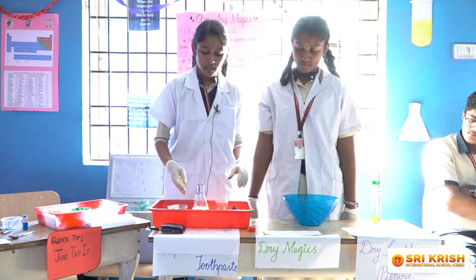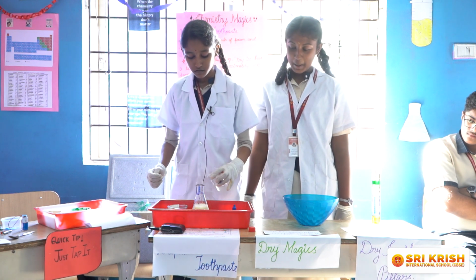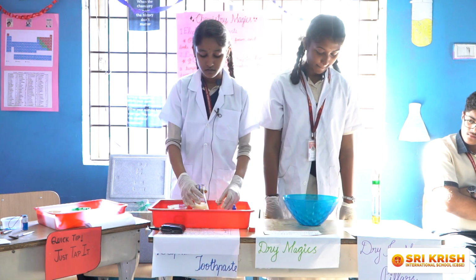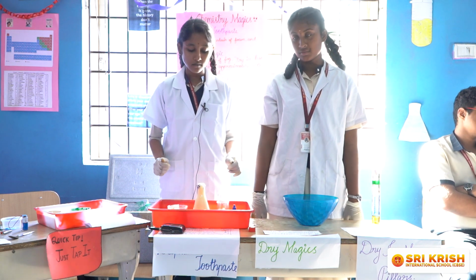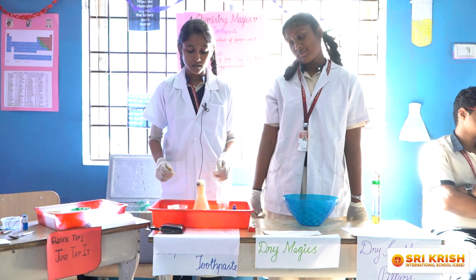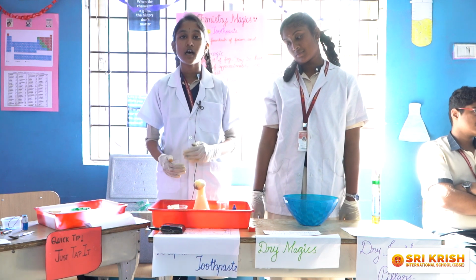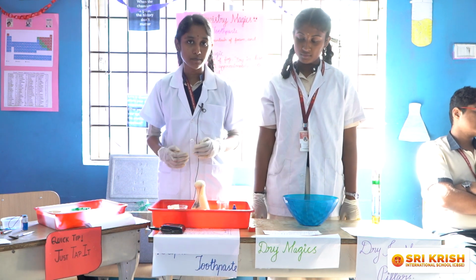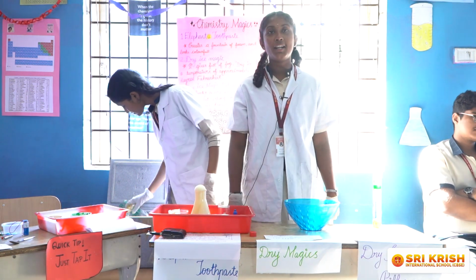Now we can see the foam formation. And it is called elephant toothpaste. It also has another name, the marshmallow experiment, due to the fluffiness of the foam. Thank you.